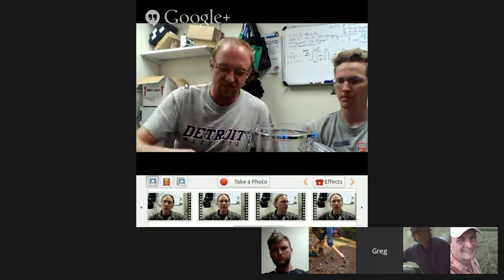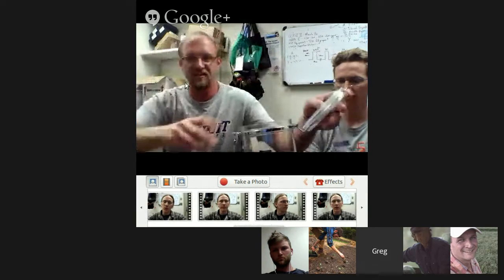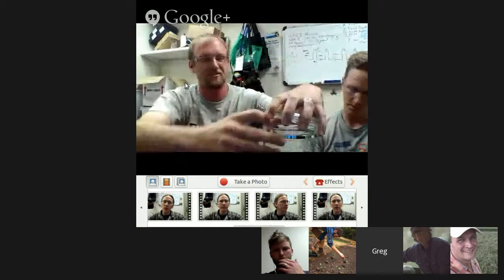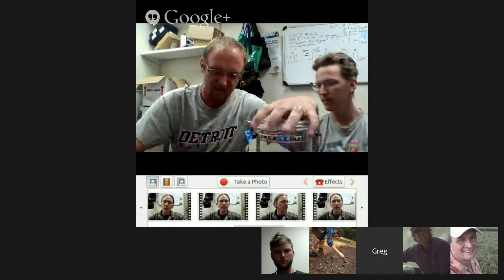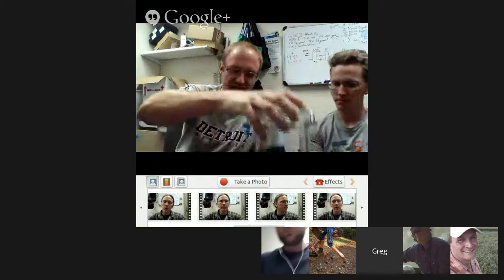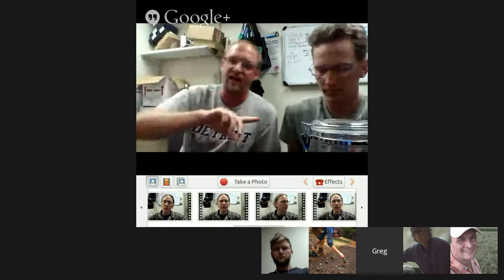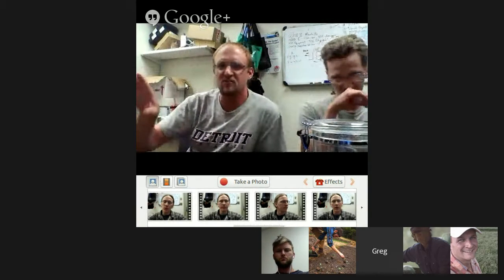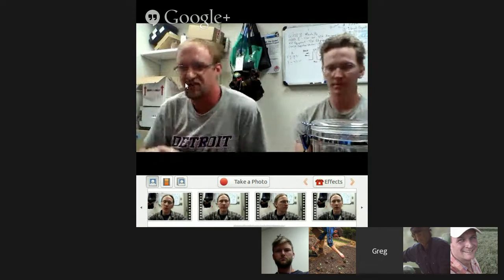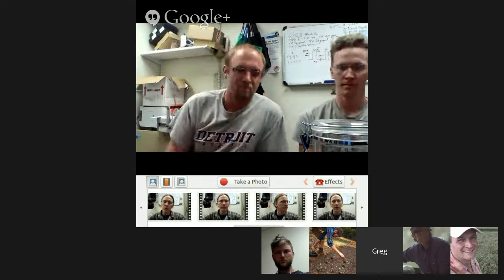So what I'll do here is I'll just put the device right inside, and then I can take my measurement, and that'll go for about 2 to 3 minutes, and then we'll get a CO2 curve, and we can then take that data, graph it, and we can get a flux rate, which is micrograms of carbon per meter squared per second.